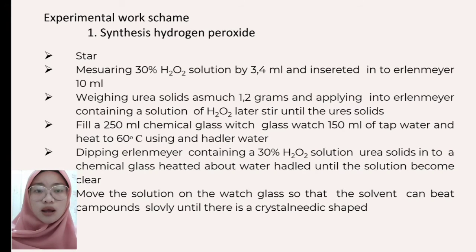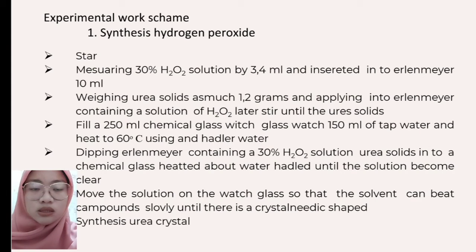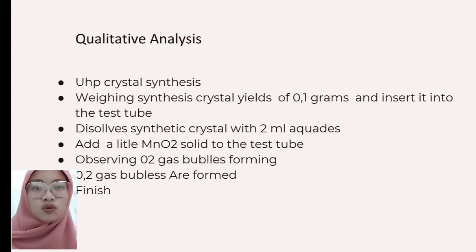Move the solution onto the watch glass so that the solvent can evaporate slowly until there is a crystal shape. And that is the synthesis of urea crystal. Qualitative analysis of the UHP crystal synthesis.